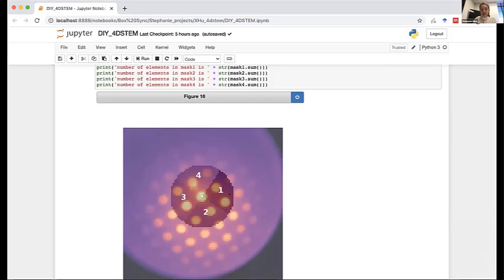We want to subtract quadrant 1 from quadrant 3 and quadrant 2 from quadrant 4. Python is a really good platform to do this because you have so much tunability over your detectors. In a traditional DPC setup, you would have just the X and the Y, straight up and down. But I've built this specifically so you can tune the outer diameter of your detector, if you wanted to bring the radius of your sphere in or out. And then you can also rotate it.